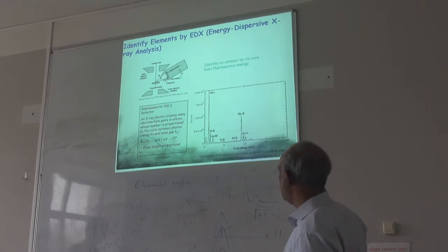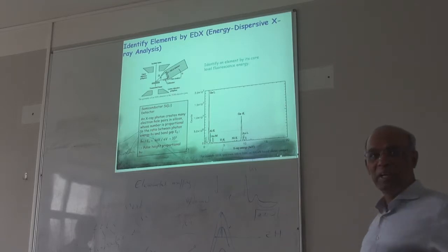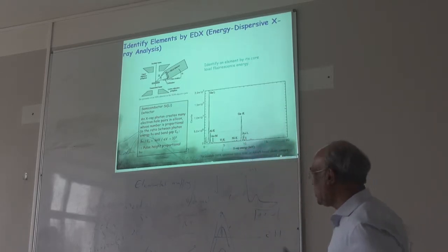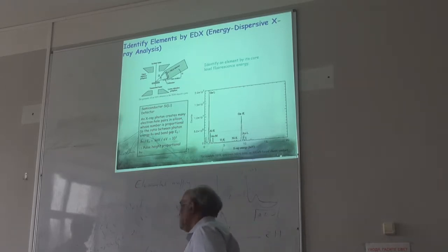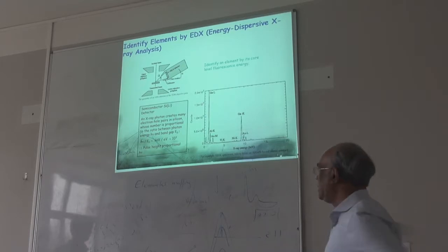Okay. Yeah, I could do one lecture on the energy dispersive technique. I need to prepare some talks for next year also. Maybe that's something we can think about. Also, this EDAX you can do not just with electrons. You can even do it with incoming X-rays. But since we are using the electron microscope, we can use that energy directly.